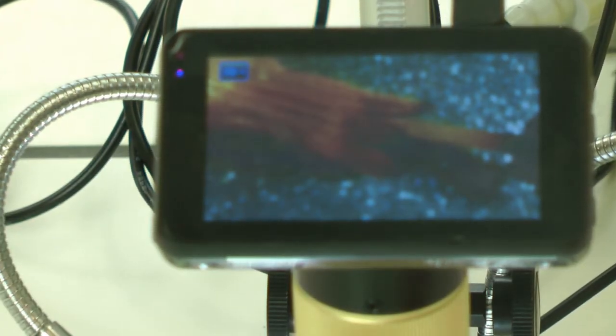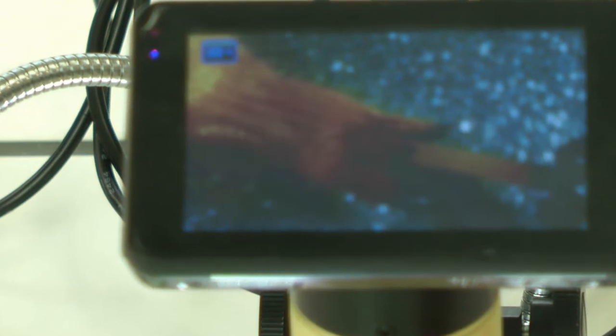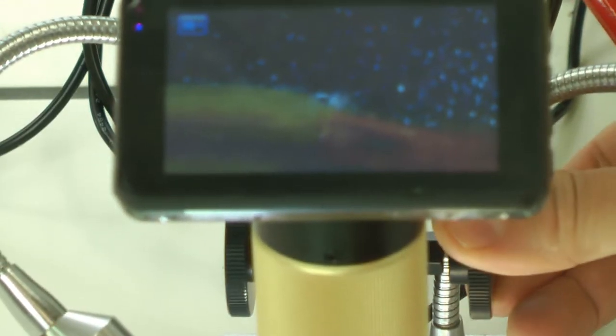And at the microscope, obviously this is quite a big flower. Under the microscope you can see here the stigma, which is curled up, and inside I expect there to be anthers. We'll try and pry it open in a minute. And here you can also see the ovary, which will contain one ovule in this case. Here you can see how I've pried open the disc flower and I have made the anthers visible, these brownish things. If we put the ray flower under the microscope, let's get the focus right, we don't see a stigma.